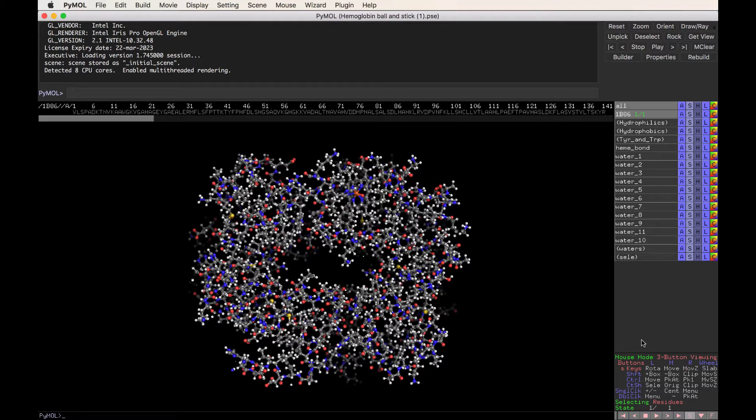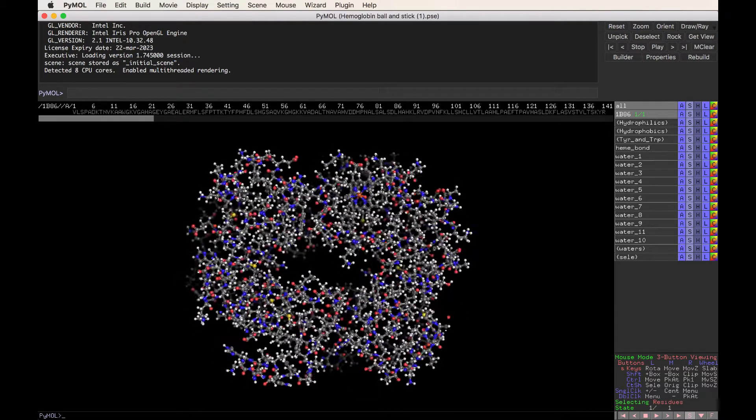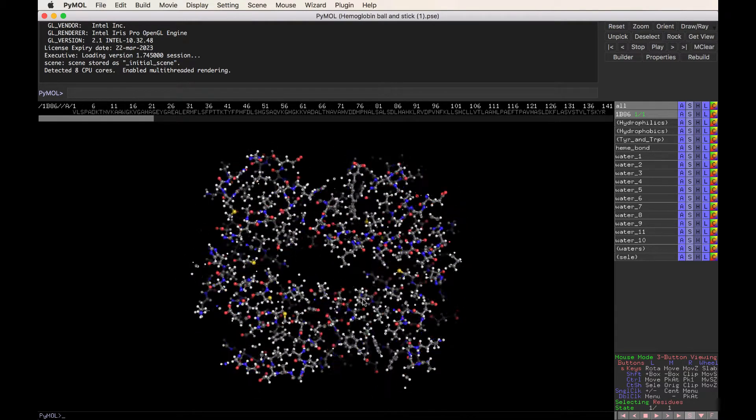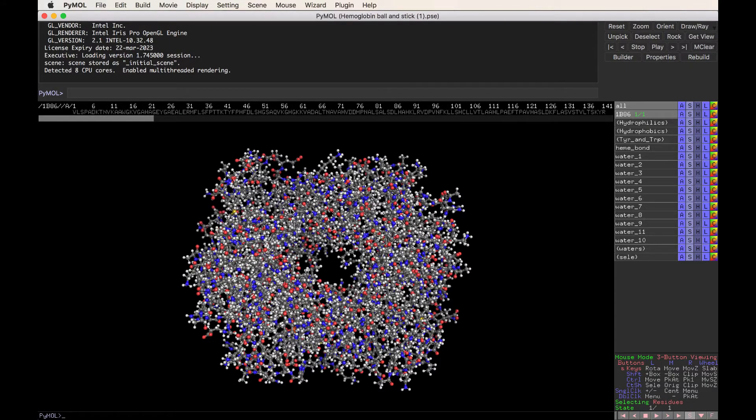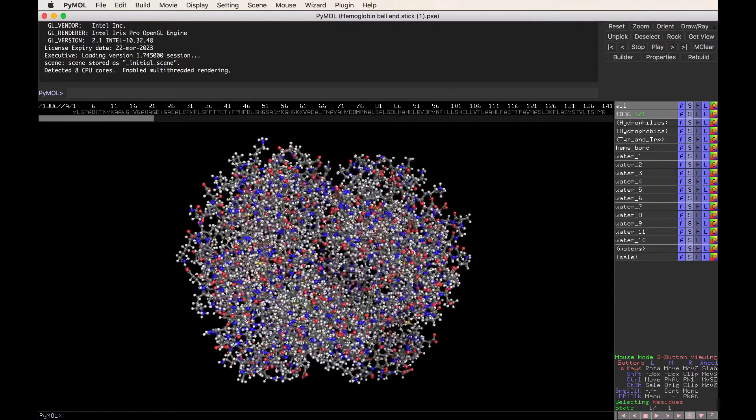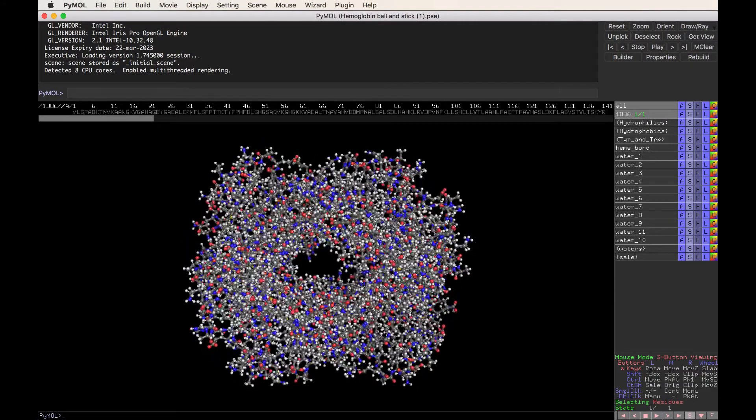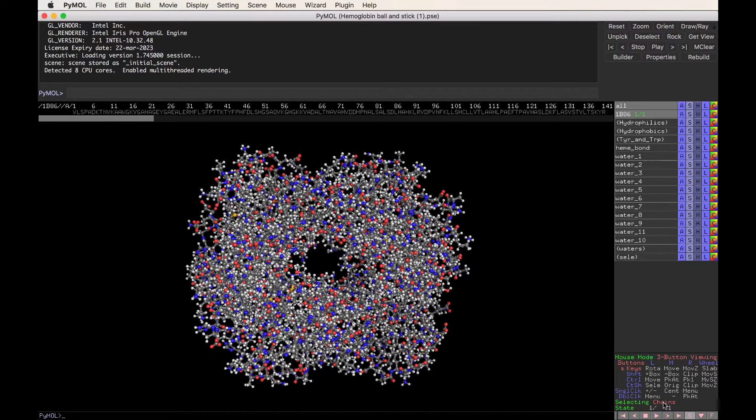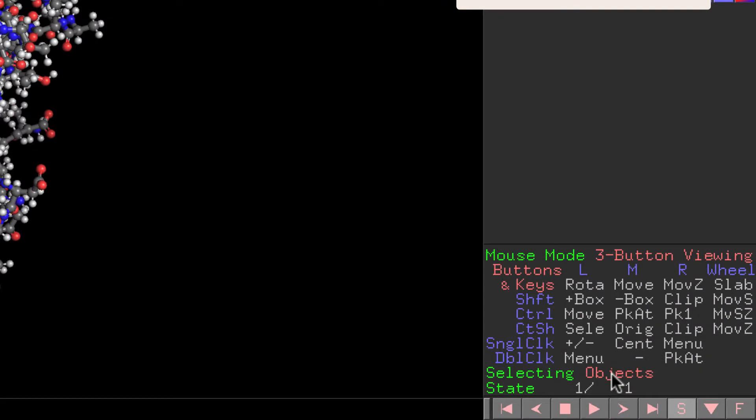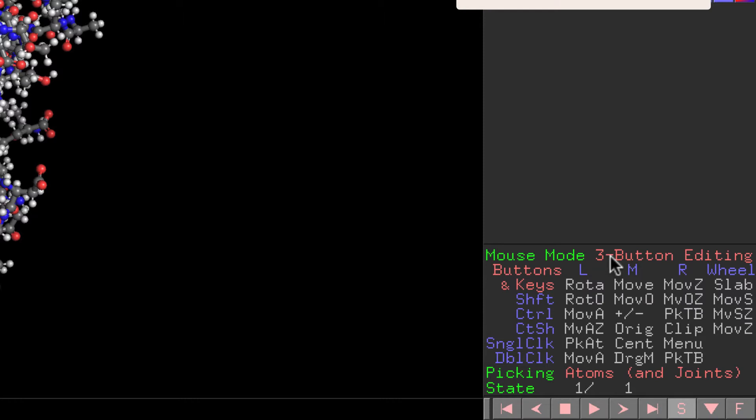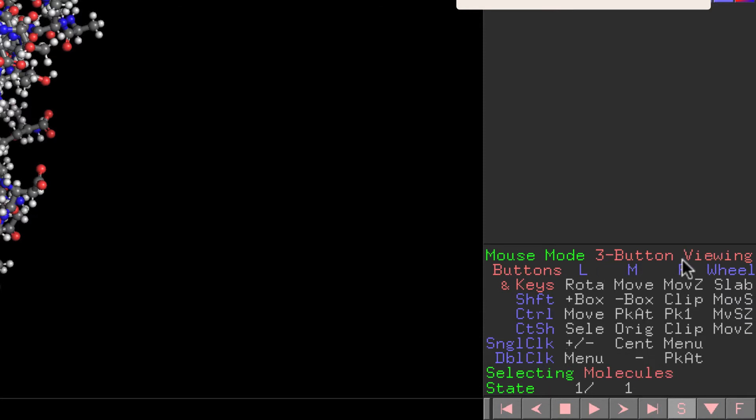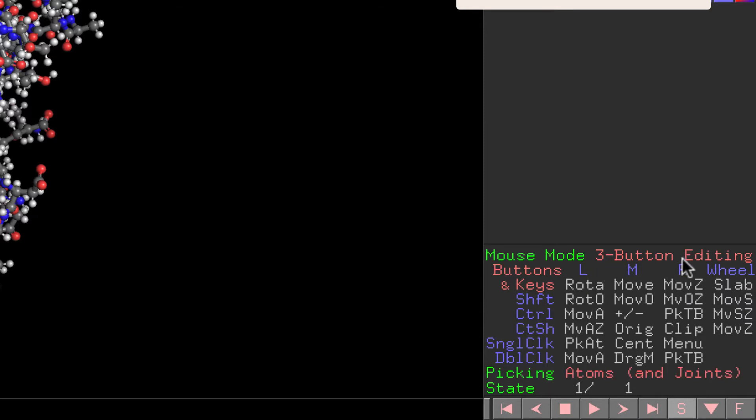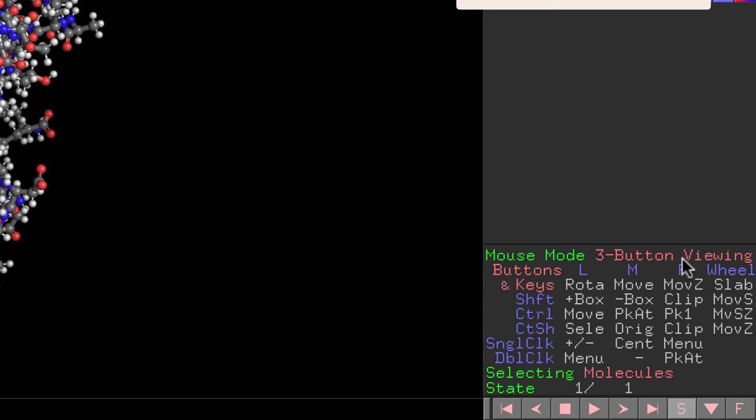PyMOL can change the look of the structure to sort of emphasize different features of the structure. So one thing about large molecules is that the surface and the topology of the molecule's surface is very important to know about. So that's what I'm going to do for this structure. I'm going to first render the surface of the molecule. To do that, we're going to go down to where it says Selecting State and toggle, which means clicking through a bunch of options, to find where it says Molecules. Now, if you're clicking this and it's not working, it's because you're in the wrong mouse editing mode.